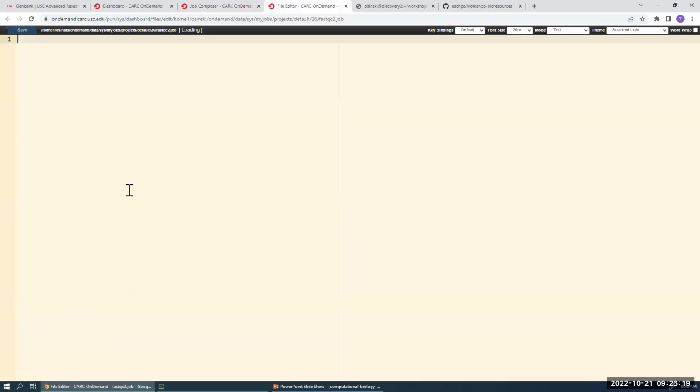So in this situation, we have 6 files to analyze quality.